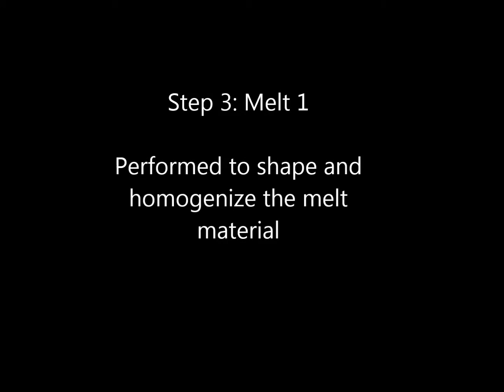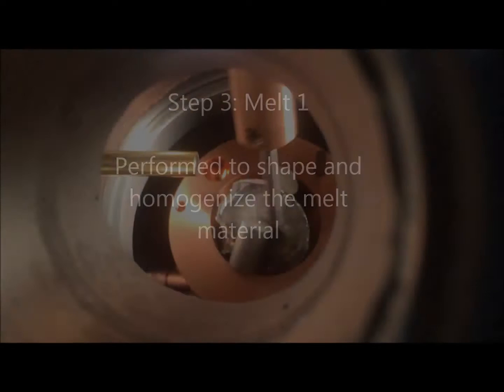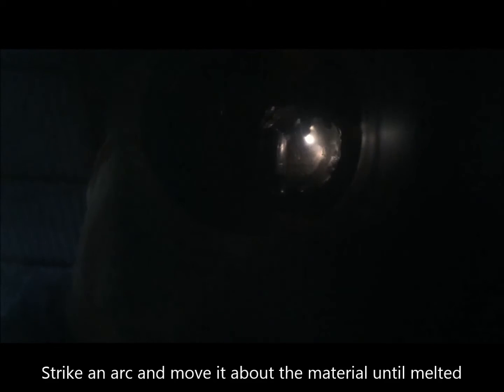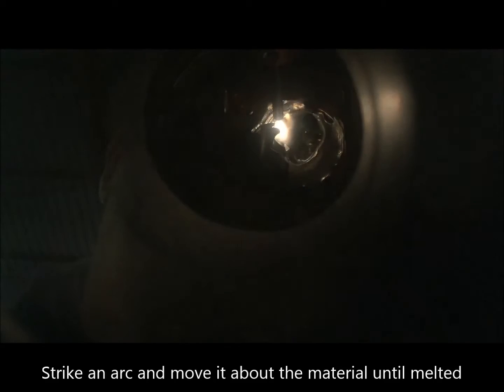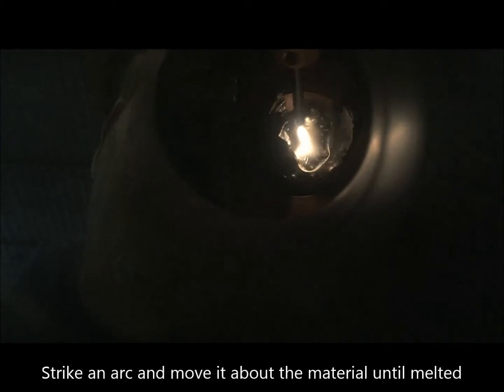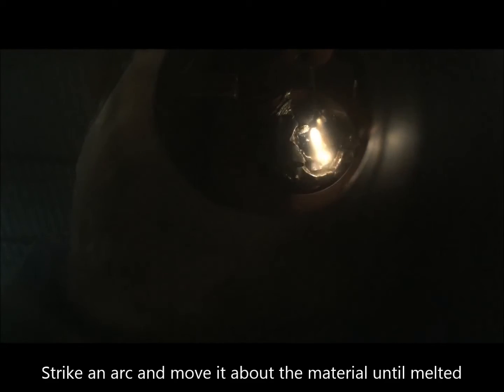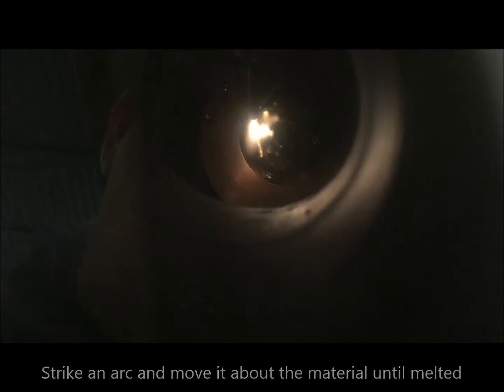Once the atmosphere preparations are complete, the operator then strikes an arc with the tungsten electrode. Once the arc has been established, the operator moves the electrode around taking care that all the material melts completely and mixes into one molten button. This may take some practice, but most catch on quickly.